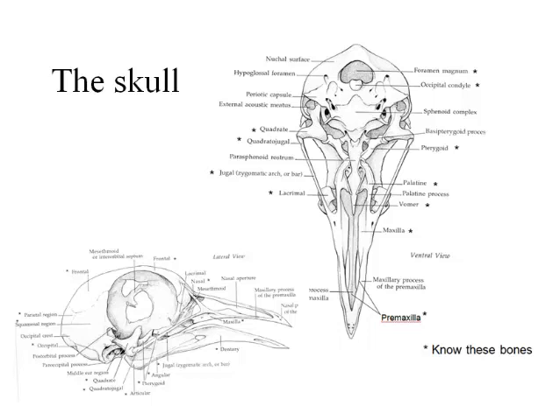It's hard to see individual bones in bird skulls, unlike mammals, but you can tell if it's a frontal, parietal, or occipital based on the region of the skull. It's pretty crude, but if you get the right area, you'll be fine.